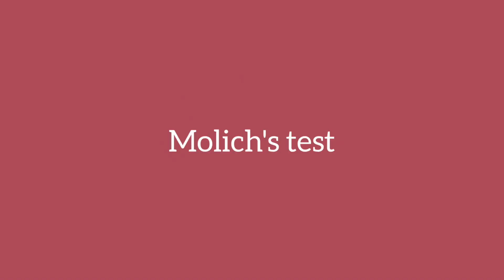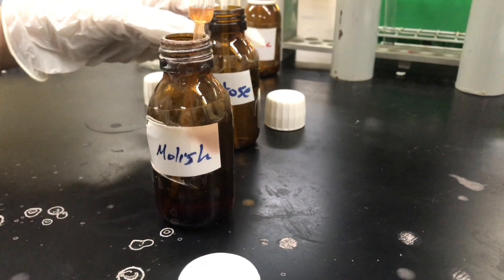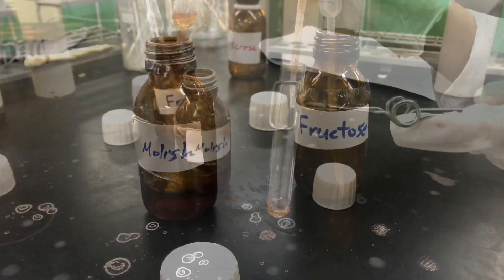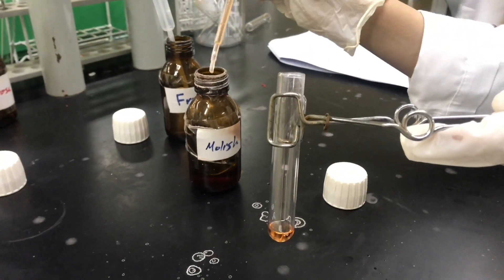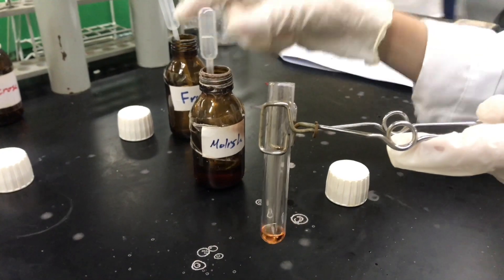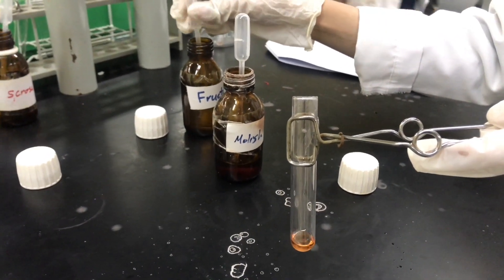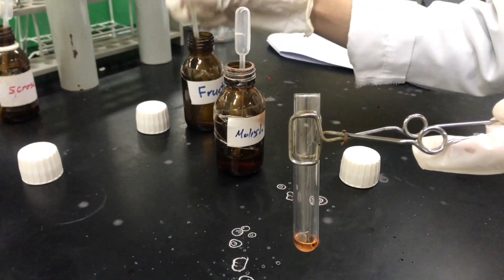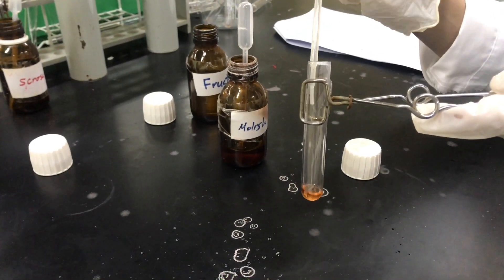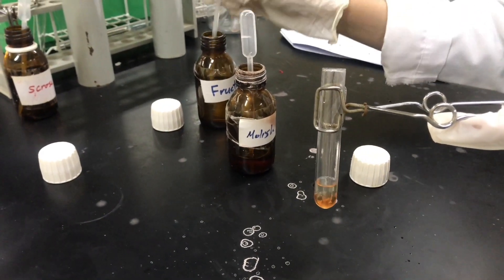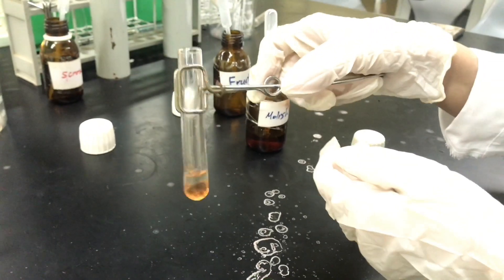Starting with Molisch's test, which is going to show us the presence of carbohydrates. In this experiment, we chose fructose as our choice of carbohydrate. Add two drops of Molisch's reagent to two mils of the test solution and shake well.